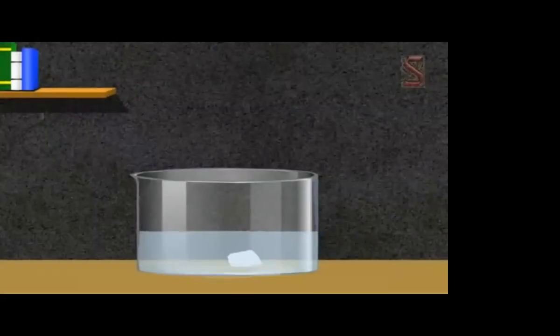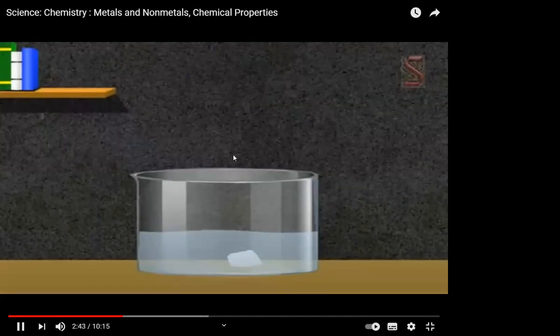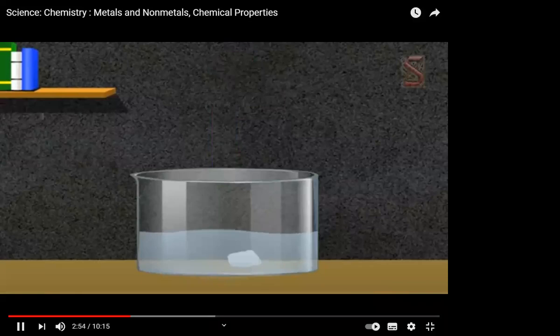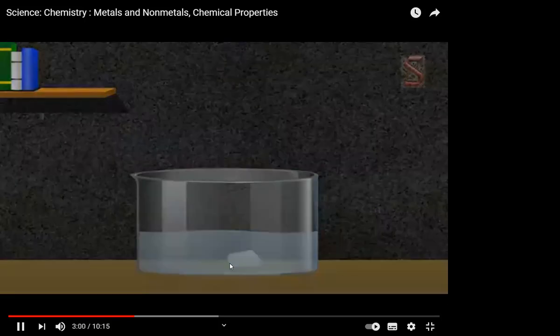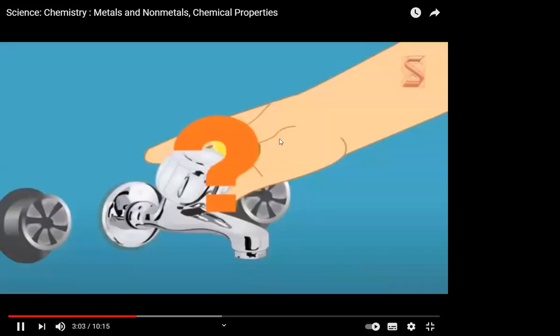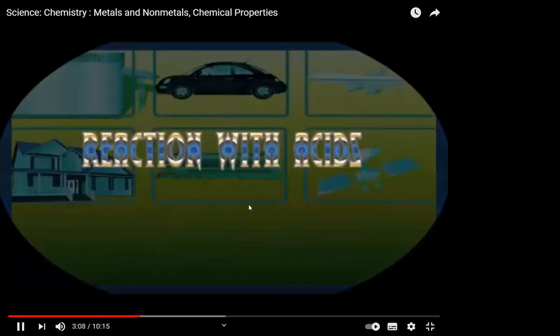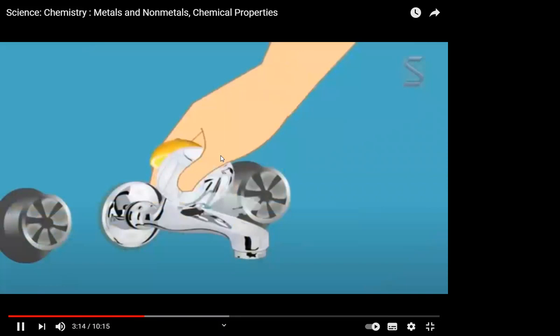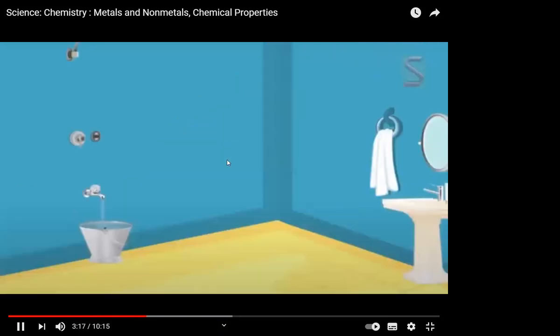So, now you understand how much heat is produced in the reaction. When you introduce a red litmus paper, it turns blue, indicating that the solution formed is basic in nature. Be careful. You should stay away from the water trough during the reaction. It gets very hot. What are you doing here, Father? I'm cleaning this tap with a lime peel. The tap is looking dull because of the deposits of calcium salts in water.